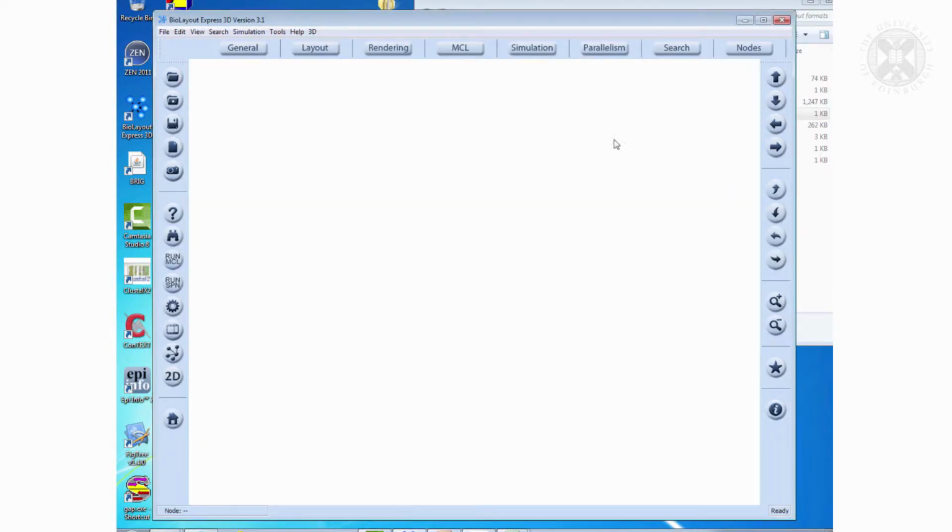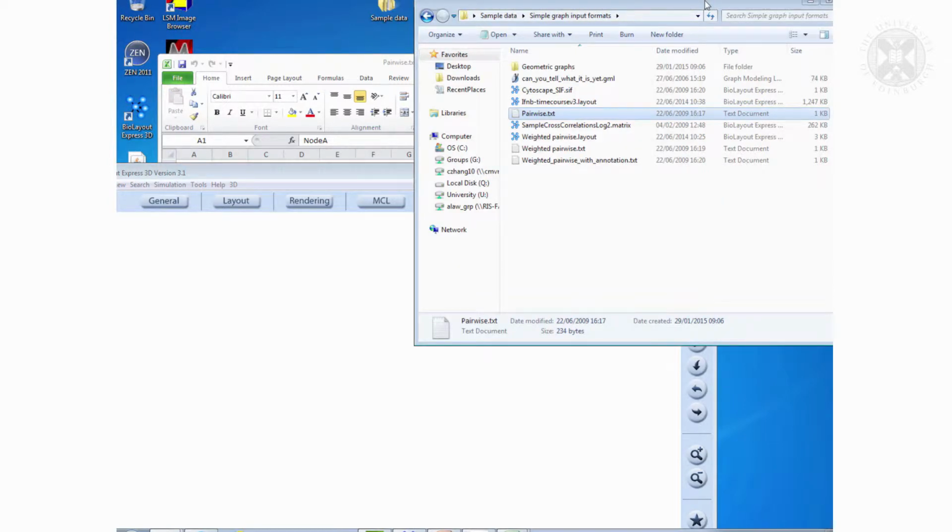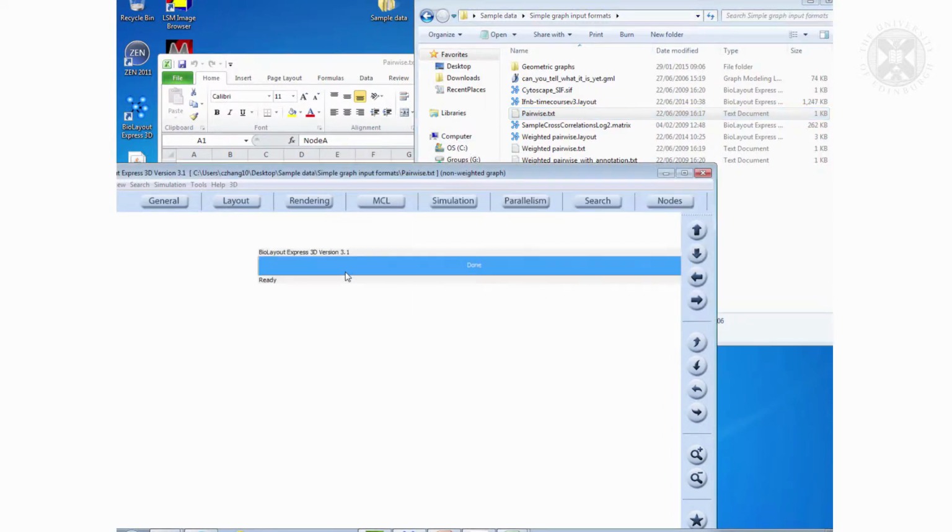So let's open that. Again, if you're getting behind, please shout. I can always come from behind here. Obviously, I can't see what you're doing on your screens, which is probably a good thing. But I'm happy to stop and help you, but please shout. I can't see if you're struggling to keep up. So take this pairwise file, and let's just drop it in here.